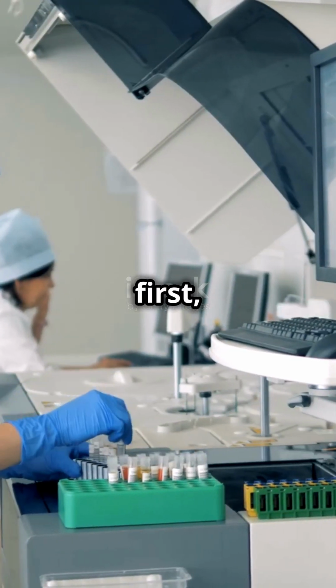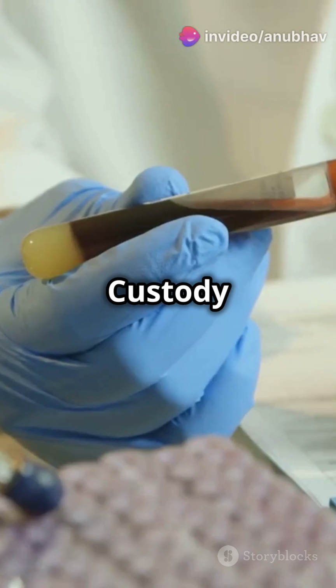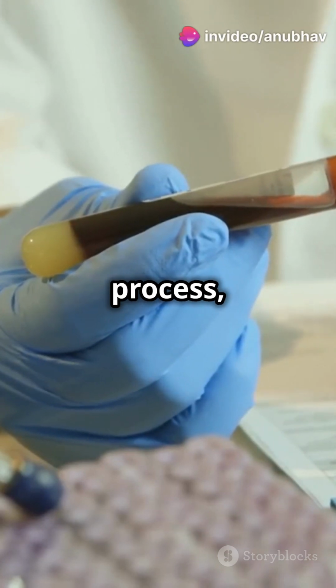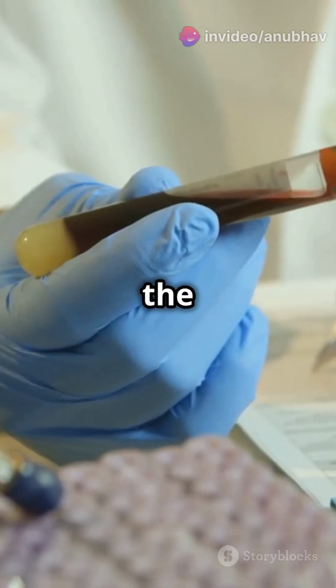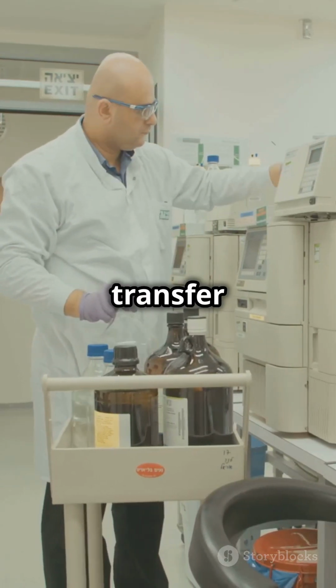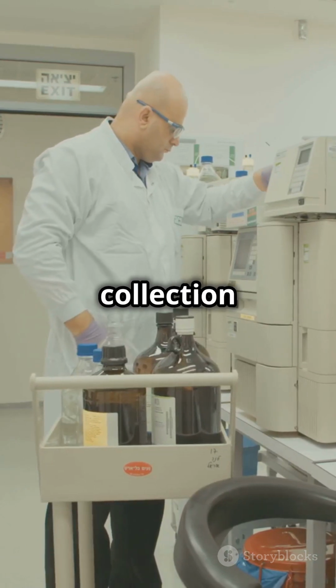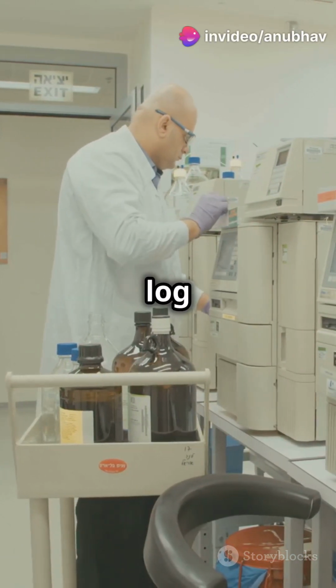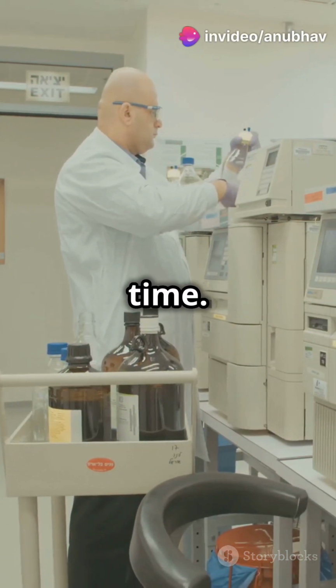First things first, you need a chain of custody form. This form is the backbone of your process, documenting every step the sample takes. This form records every transfer of the sample, from collection to final analysis. It acts as a detailed log that can be reviewed at any time.